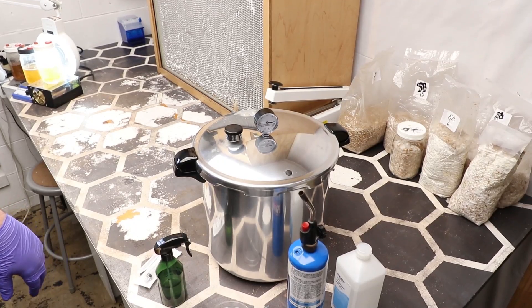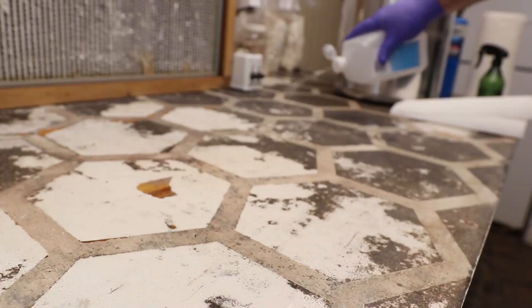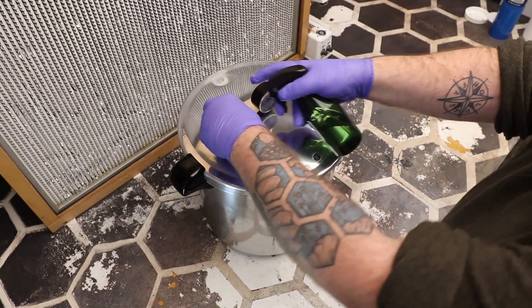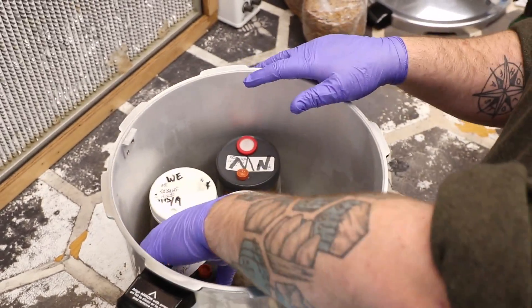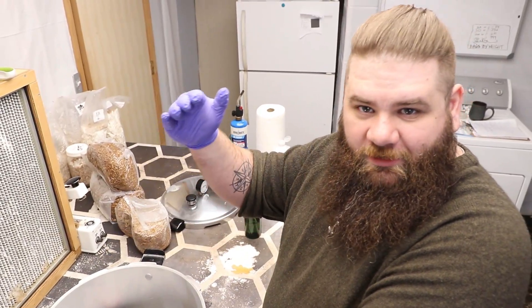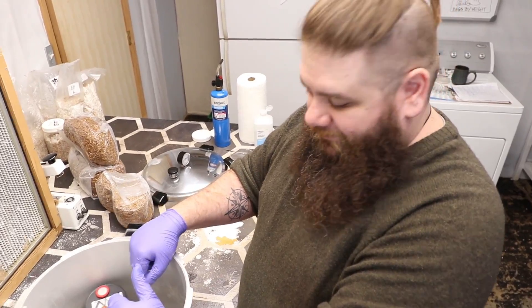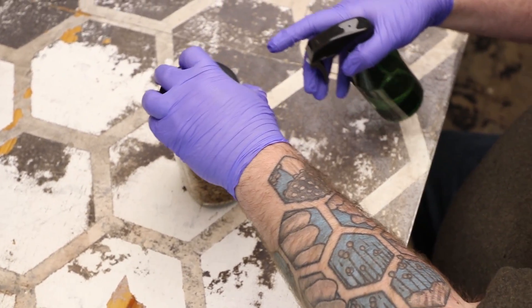To begin that process, first you have to pressure cook your grains. It's important to really sterilize your grains, and with that comes cooking them. I cook mine, even my jars, at 15 psi for two and a half hours. I have tried working the times down below that and have found that I get the most consistent, reliable results with 15 psi at two and a half hours.